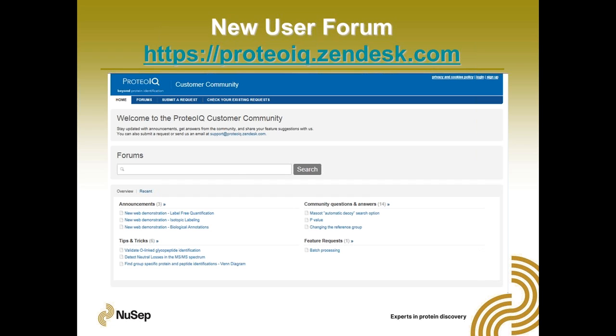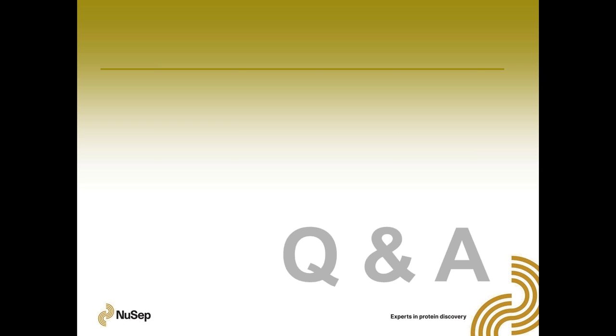Okay. So with that, I'll open that up to any questions, and then I will also jump in and look at some dimethylation setup as well if nobody has any other questions first.